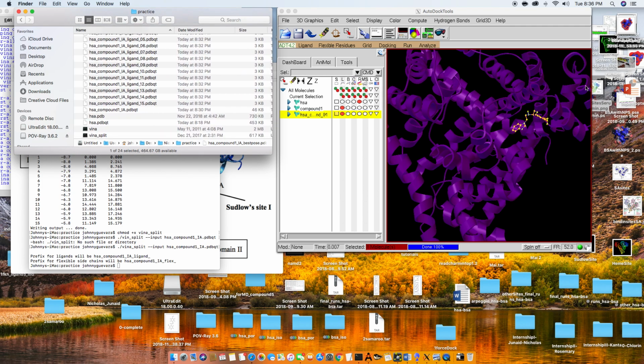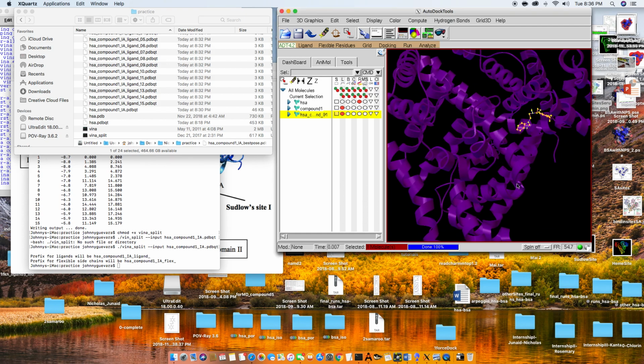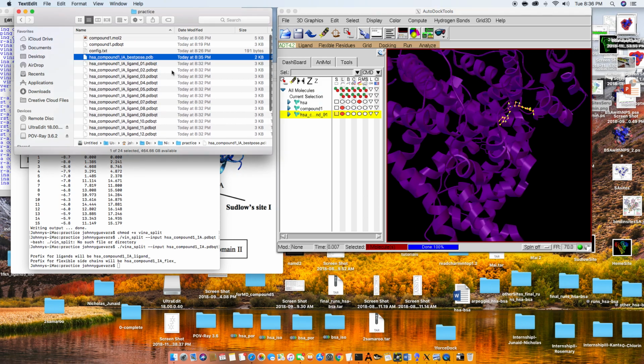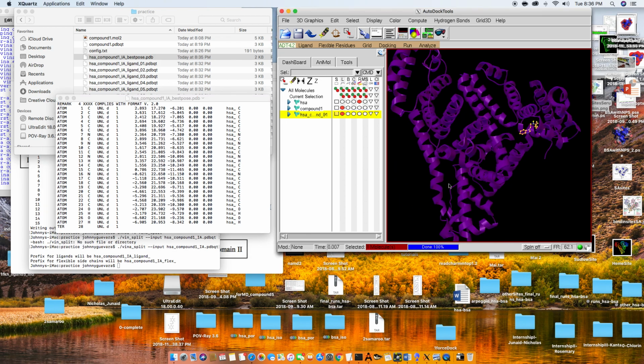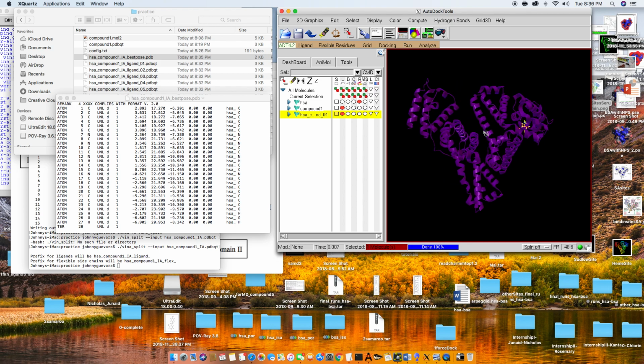So you're going to repeat that again 5 times in each domain, and for all the domains. Now, let me see something. One thing we want to do, but you know what? No, I'm going to leave it like that for now. Let's just do all these dockings, and I'll resume and make another video about how to continue. Okay, let's see.